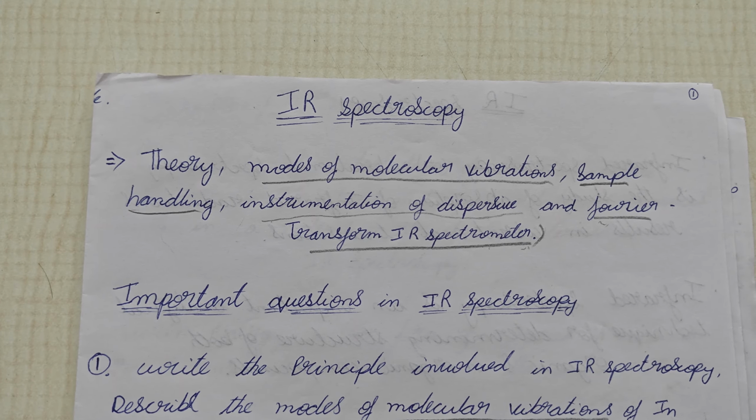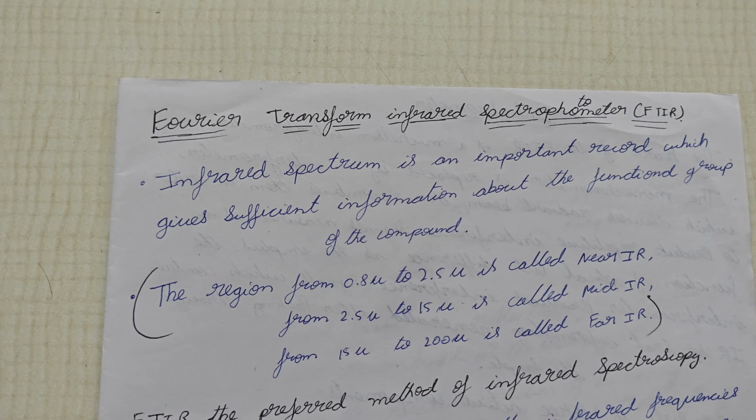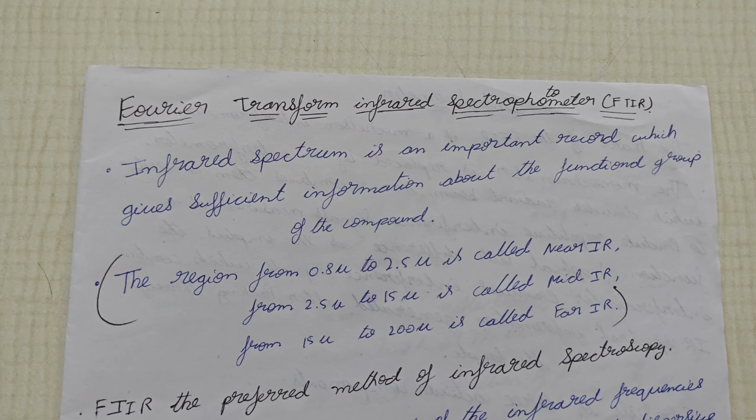Okay, guys, this is a very important topic. In our semester exam, they have asked the instrumentation, I think, the diagram. They have asked the diagram and the mechanism involved in the Fourier transform, and the modes of vibration. This Fourier transform infrared is very important from your exam point of view. Mainly focus on these two topics, then go on to the other topics.